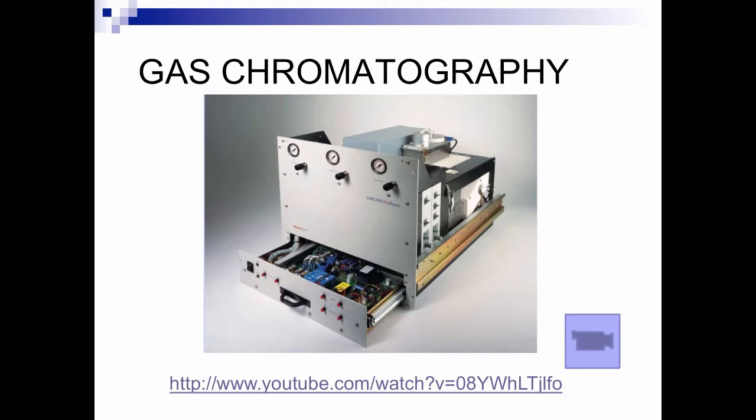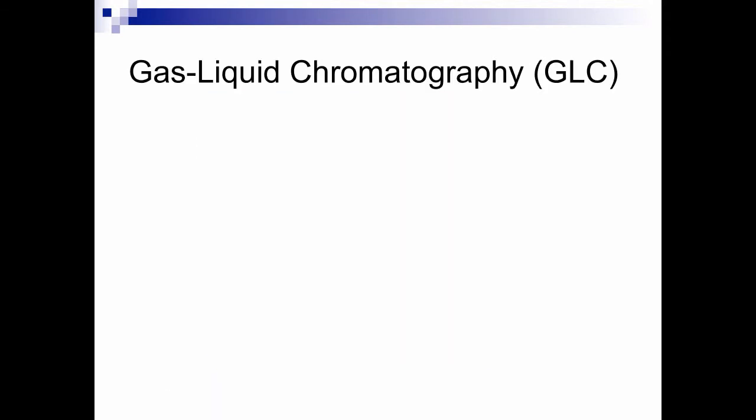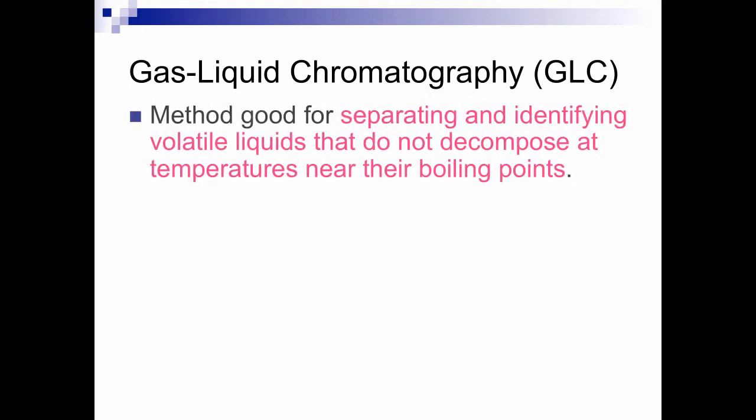The next section to be covered is gas chromatography. And according to our learning objectives stated earlier, we are required to describe its techniques. Gas liquid chromatography, or GLC, is a form of partition chromatography with an aim of separating mixtures containing fairly volatile substances, either to analyze them or to separate a required product in a reaction mixture.